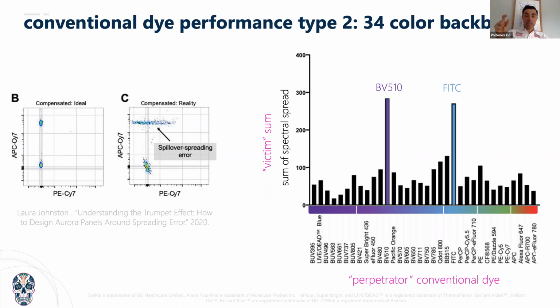And we say that's one that needs to be removed if we want to go in either direction, either deeper into immunophenotyping, right? Because we're working with folks who are looking at 20, 25, 28 colors on a per phenotype basis. So if we go very, very deep down the tree, or if we're going to do more of a survey course and go to 45, and we've got other people who are working up to 52 colors, that's what's going to enable us to do this: go in there and take out those dyes that are spreading quite substantially. I'll describe some of the stuff we've been doing here, but we quite literally set up a ranking of, okay, these are the worst performing labels. How do we take them out and replace them?